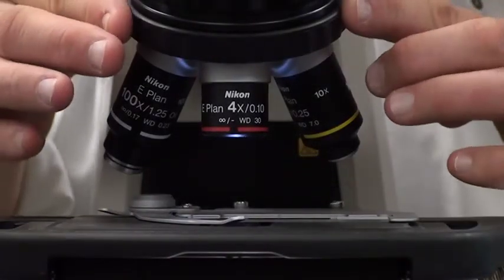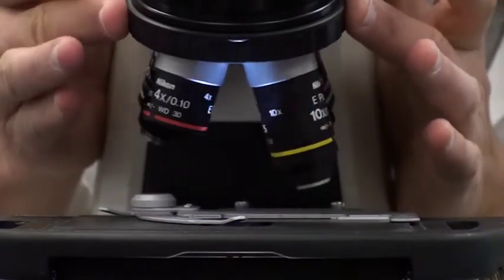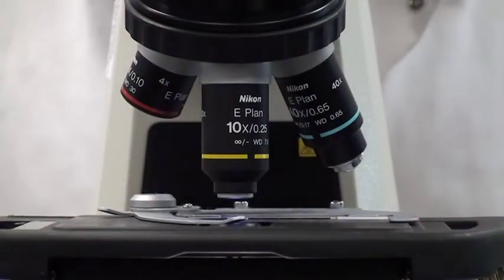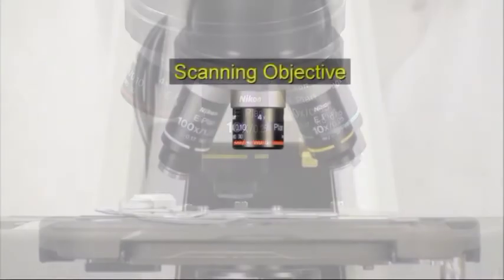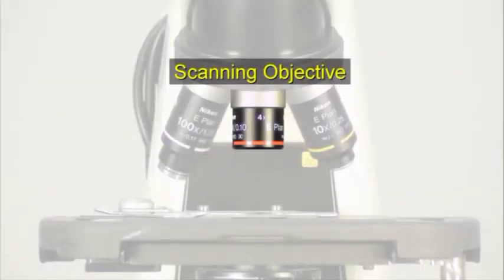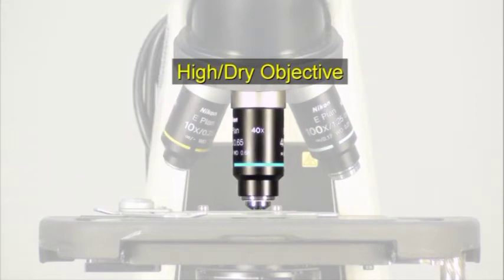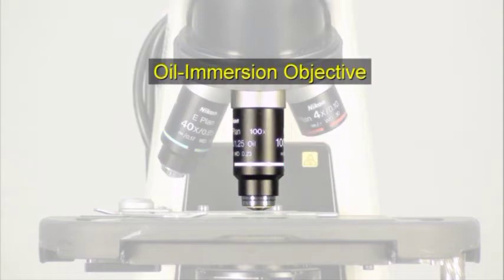The revolving nose piece is equipped with four objectives which allows the magnification to be changed quickly and easily. These include the scanning objective, low power objective, high dry objective, and oil immersion objective.